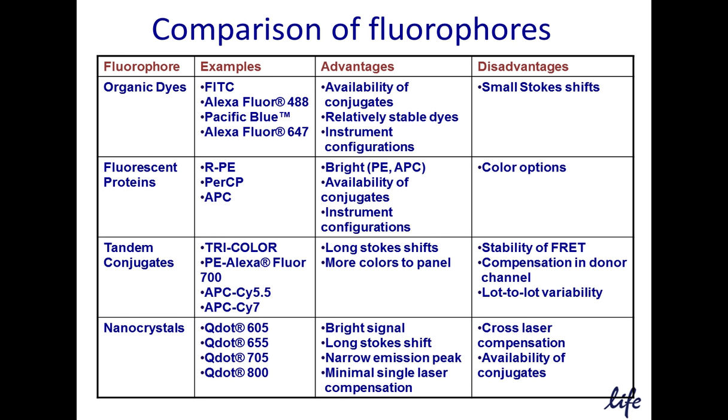Nanocrystals have a bright signal, a large Stokes shift, and narrow emission peaks, and with a single excitation laser, there is little to no compensation required. Disadvantages include availability of direct conjugates and the need for cross-laser compensation in multi-laser systems.